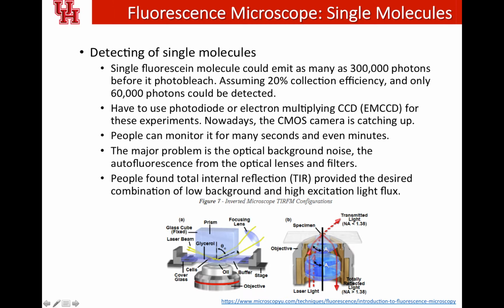So that's the one structure. And the second structure, you can see obviously it's not easy to do by the first configuration, right? You cannot change anything in between the glass, and very critical is the distance between these two glass lines. And then it looks like a pretty difficult thing.